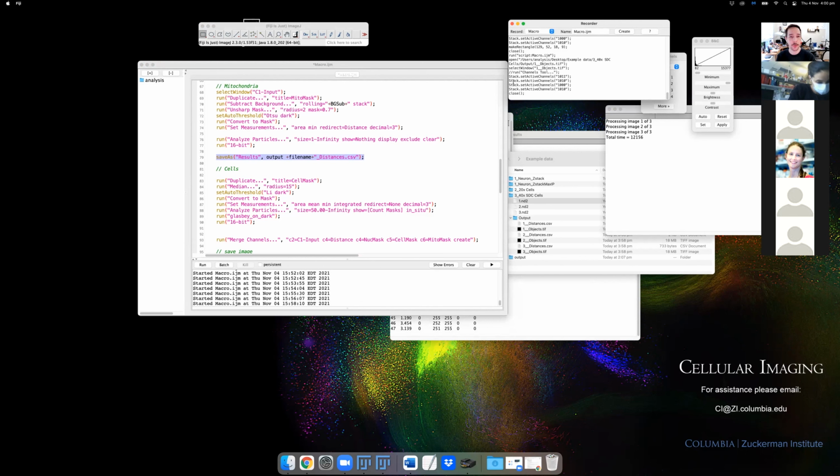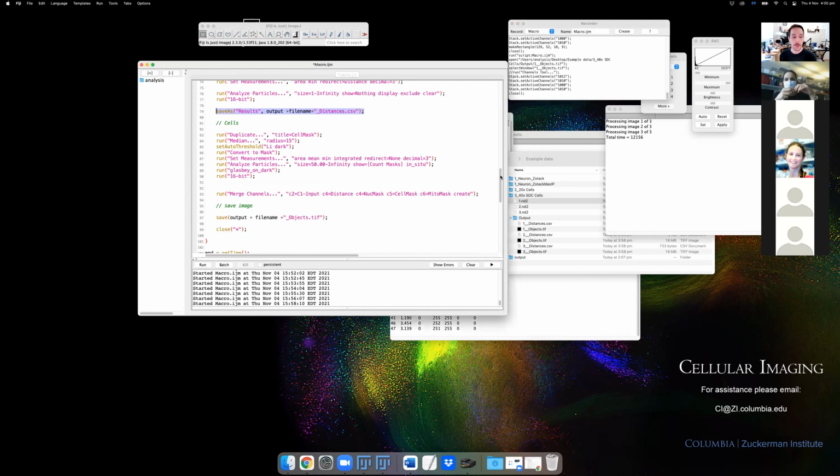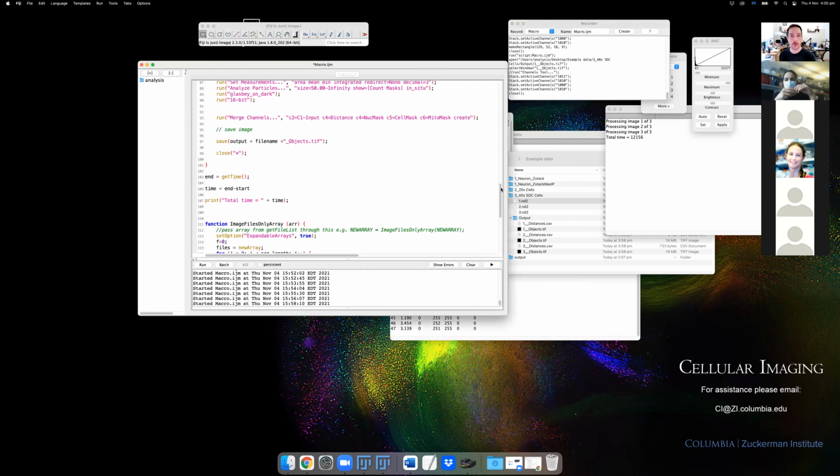And really, it's not until you have to process really heavy data that you need to start writing additional things, like things in JavaScript, to be able to do things in a more effective way. Just using the batch scripting will get you a lot of the speed for most of these things, especially for smaller scale projects. Yeah, does anyone have any questions to wrap up with?